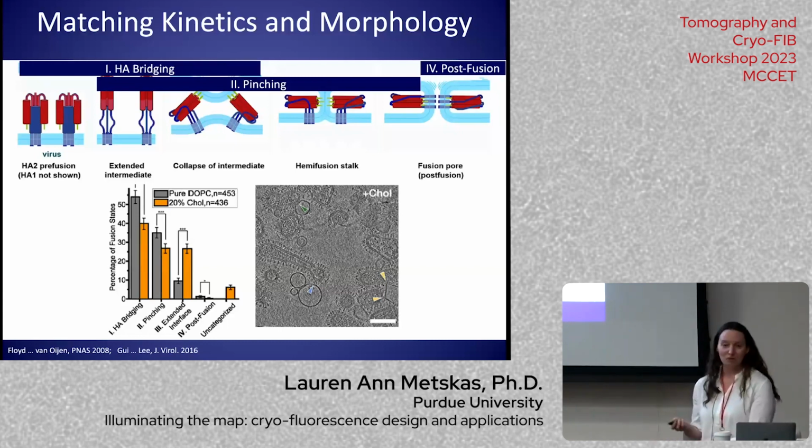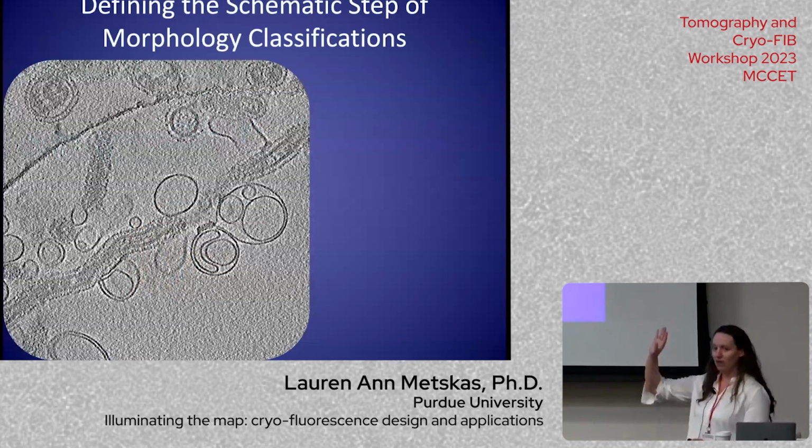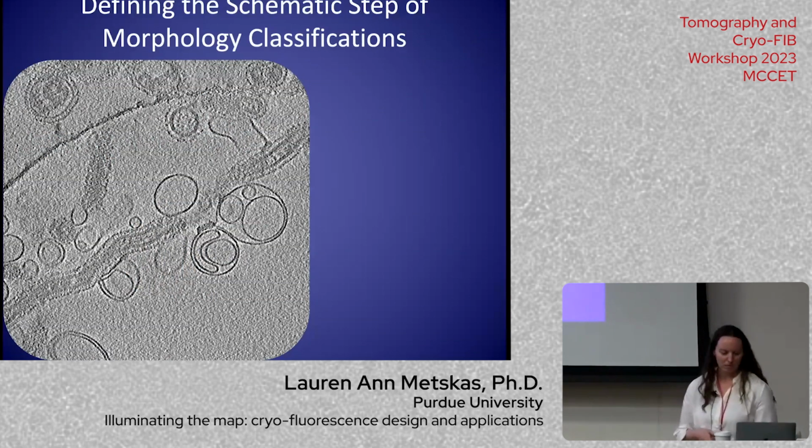Well, we need to get the chemistry back on the grid. That's the only way to do it. And so I designed a fusion assay to do exactly this. I'm going to play for you first the tomogram, and I want you to look, you can see all of those different interactions on this: bridging, pinching, and extended interface. I want you to just look at it and see, what do you think is functional fusion? To orient your eyes, this fluffy thing is your virus filament, and these are the vesicles.